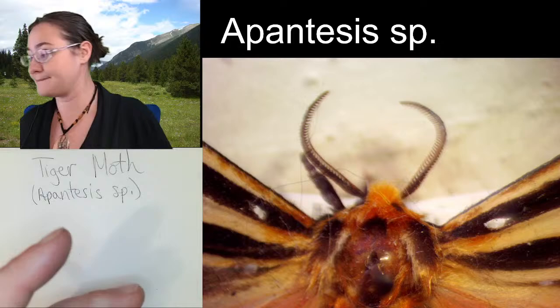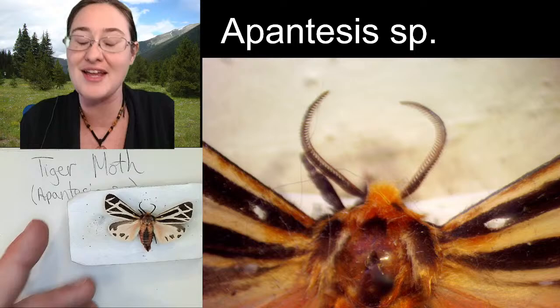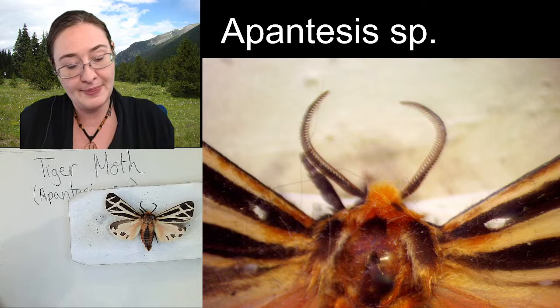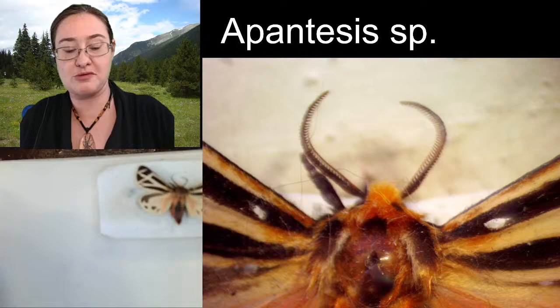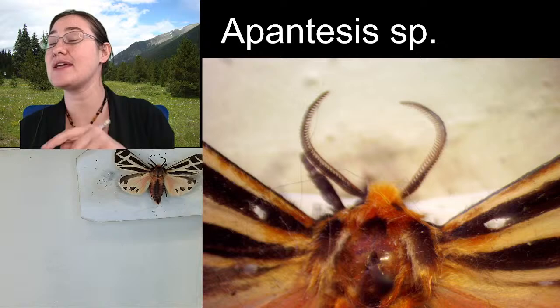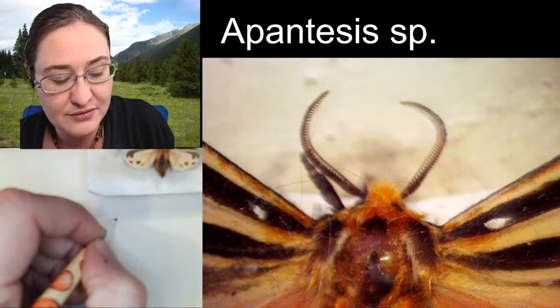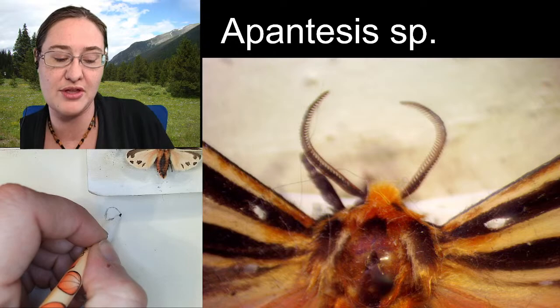So with moths, moths are generally going to have fairly wide bodies, and they are nice and fluffy, nice and setose, absolutely covered in hairs. I'm going to be sketching mine with its wings open, so I'm just going to turn my paper now to give myself a little bit more room. And I want to start with the head. The head is underneath our microscope, so you can see that pretty clearly. It's fairly short. I'm going to put that guy right around here. And I'm just going to be starting my sketch really light with this little D-shaped head. Flat on the bottom, rounded on the top.